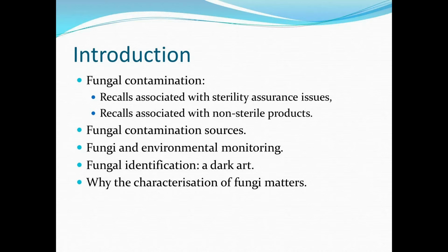have a look at the recalls associated with sterility assurance issues, and also some recalls associated with non-sterile products. We'll also have a look at fungal contamination sources in clean rooms, have a look at the detection of fungi and environmental monitoring.